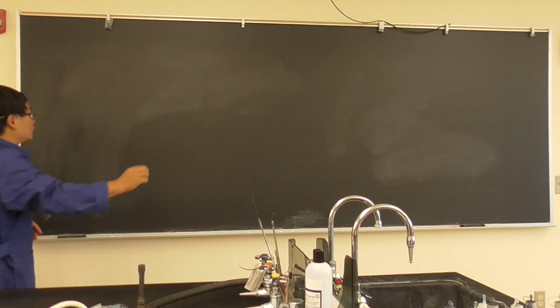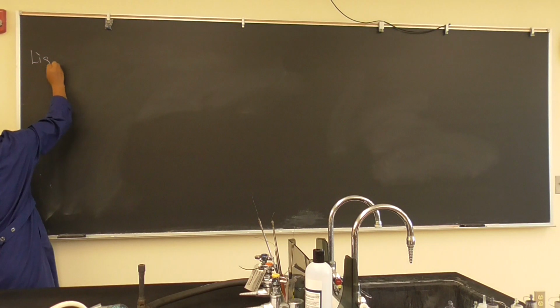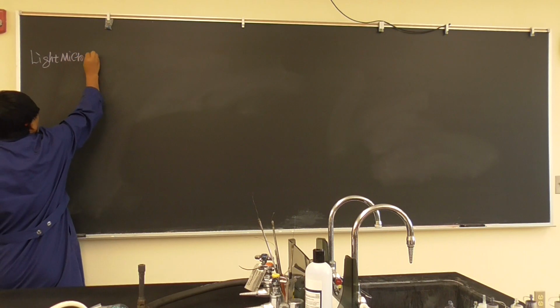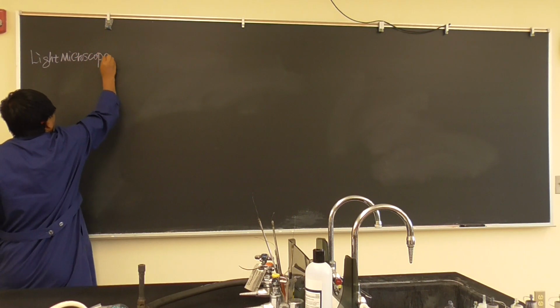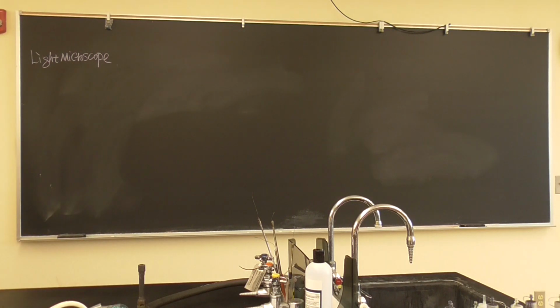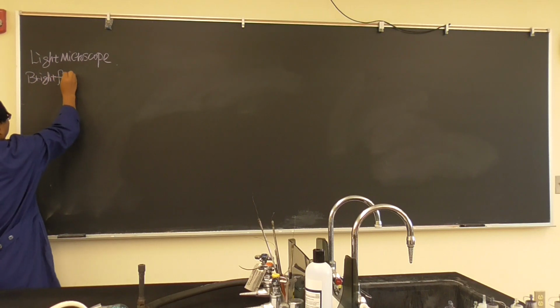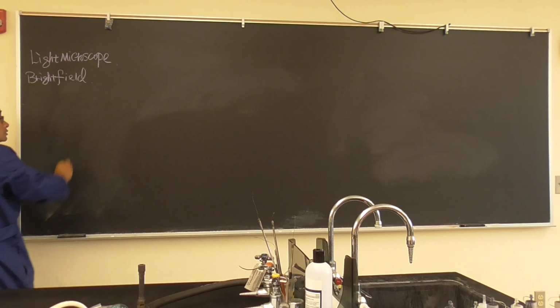What we are doing here in the lab is light microscope. And for this specific microscope on your bench, this is called bright field. So what does this mean?